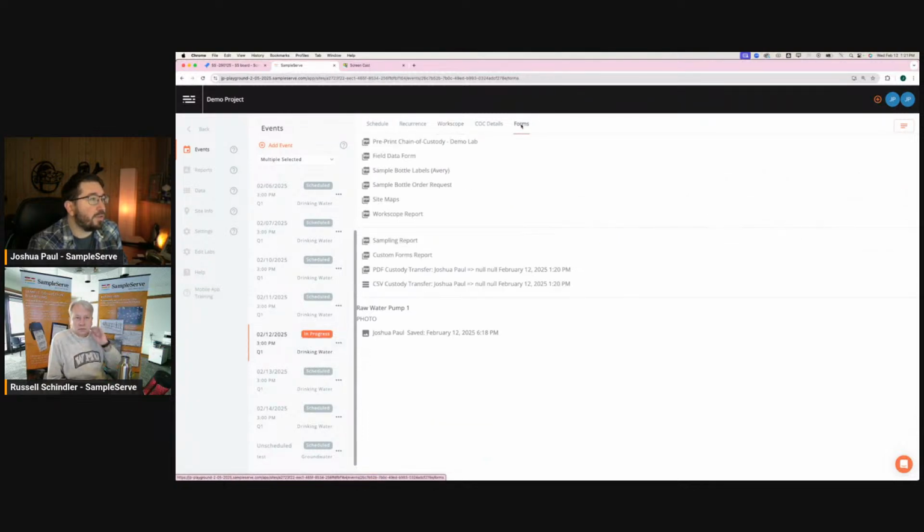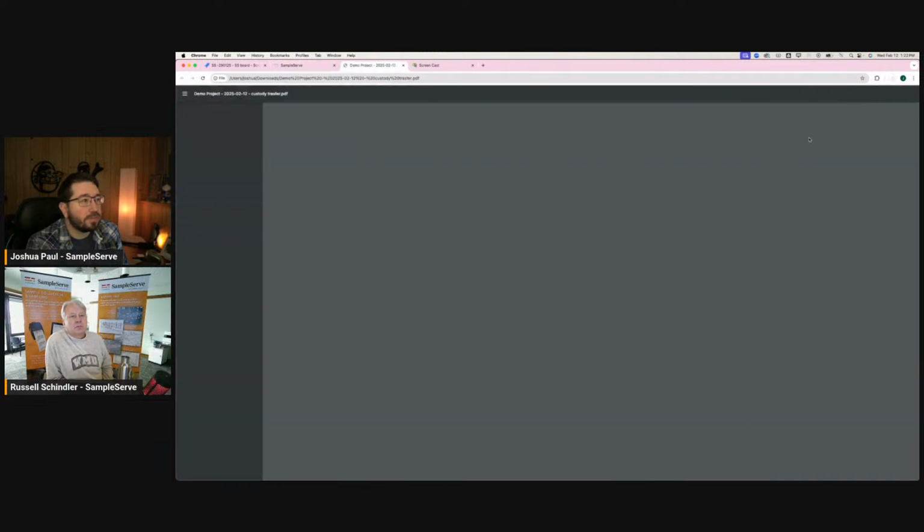Let's head over to the forms tab here. And the reason we show the in progress is so that if you had a project manager who was going to make a last minute change, he knows that that person's already downloaded the event and started work. That would be a message to them going like, hey, you better call them and tell them you're changing the scope. Right. And then let's download that chain of custody that we have available now.